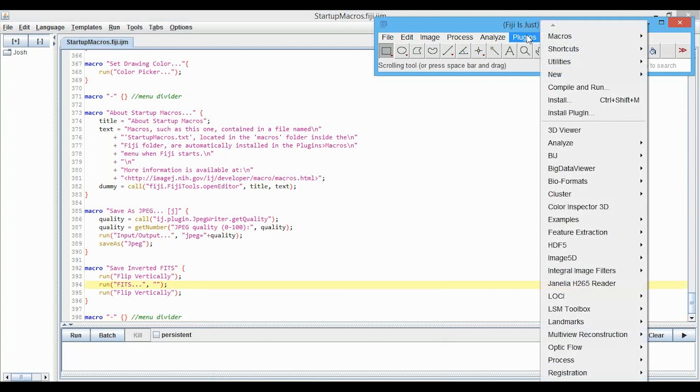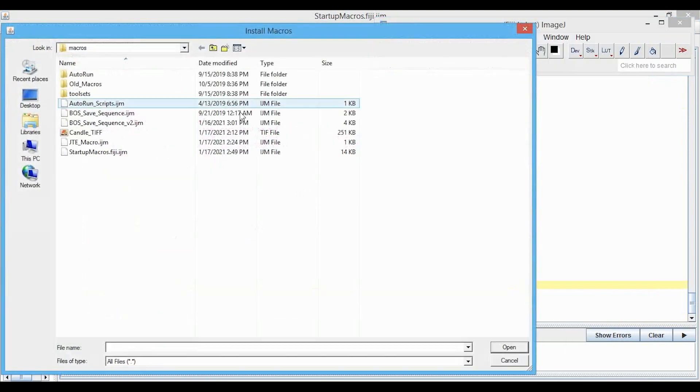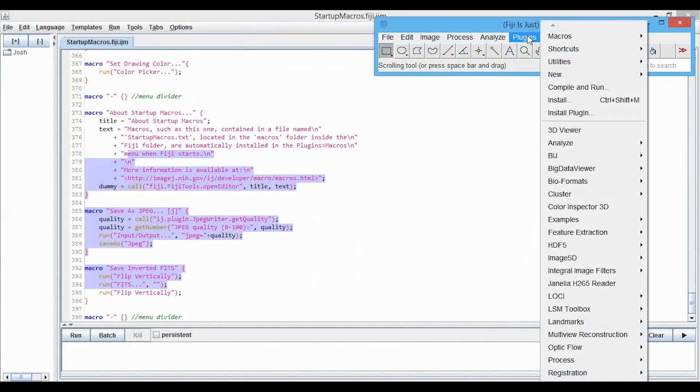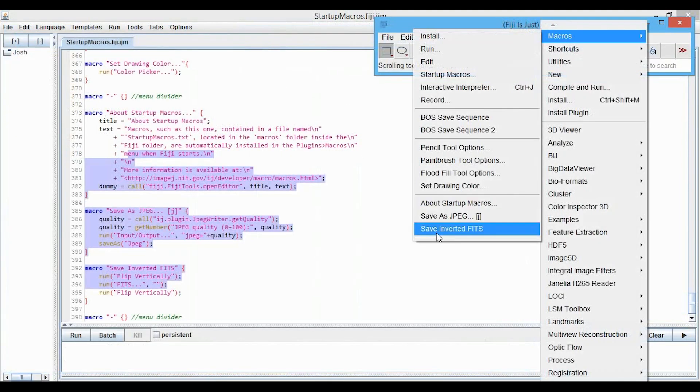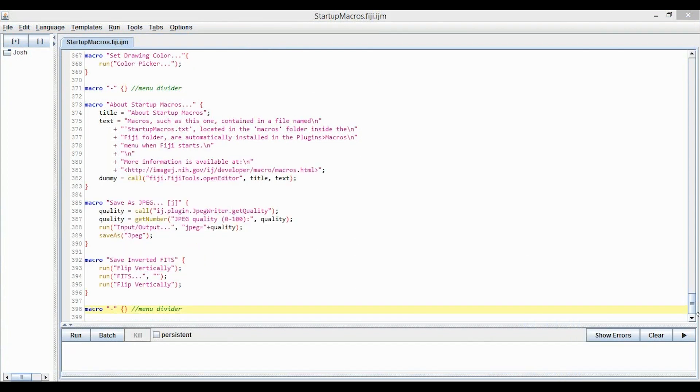But we can check it right now without restarting ImageJ by going to Plugins, Macros, Install. We will install this startup macro, and then if we go to Plugins, Macros, we can now see that menu divider at the bottom. Okay.